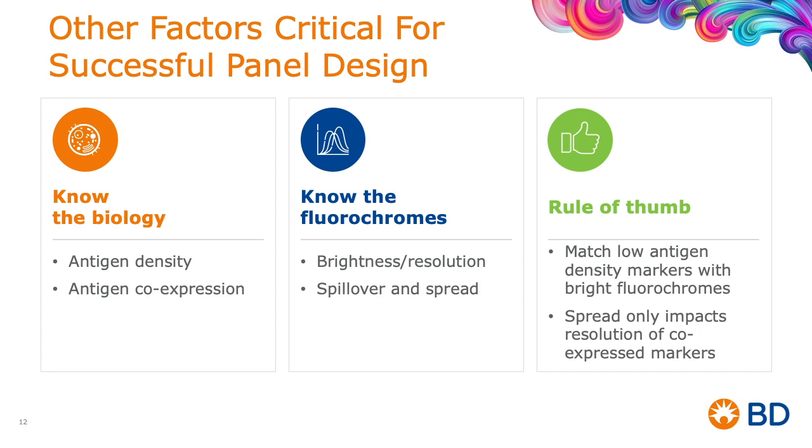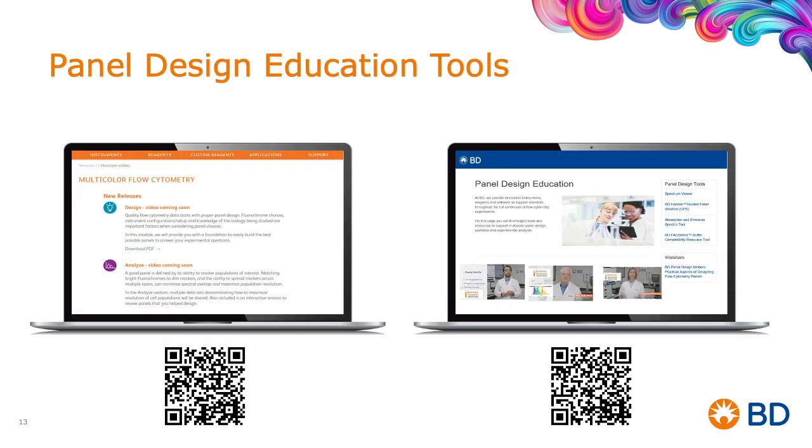Just last week, Bob Balderas gave a great comprehensive webinar on panel design that touched upon all these critical factors, and I highly encourage you to access this webinar on demand on our website if you didn't have the chance to attend it live. We also have a number of other resources and tools on our website to educate you as needed on these critical factors for panel design. But I would really like to move forward now with the presentation and again speak about the impact of spillover and spread in the process of panel design.